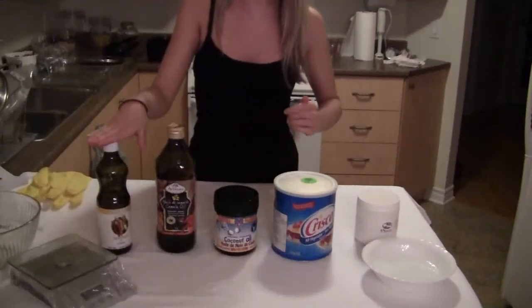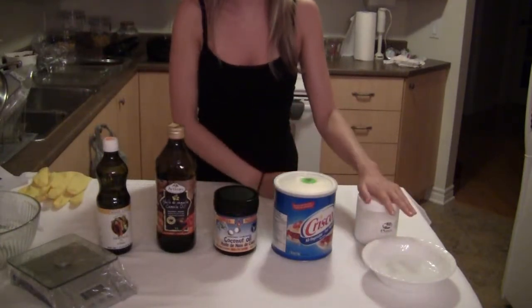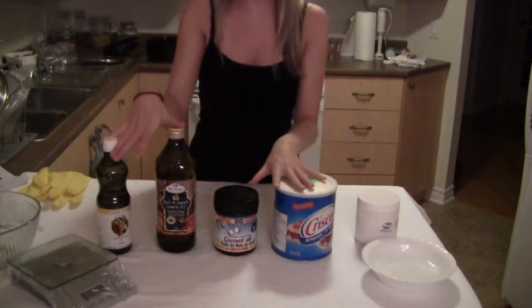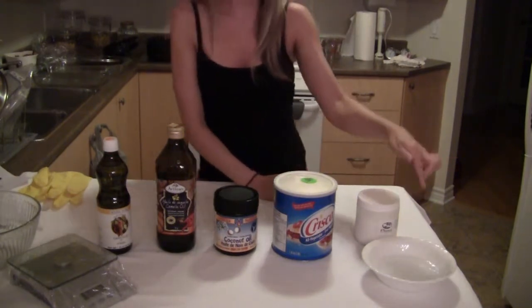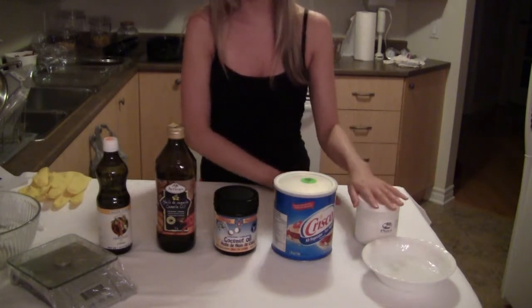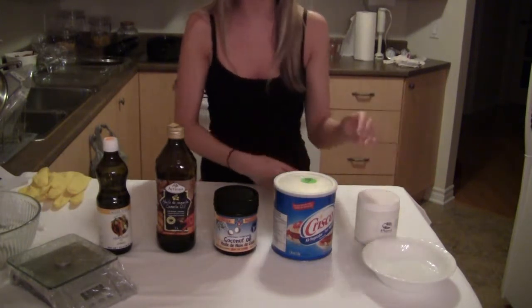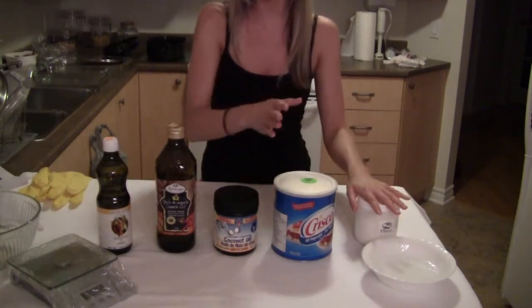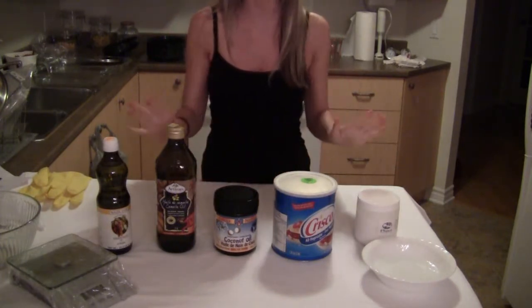Let's take a look at what we're going to be working with today. We have some grape seed oil, some canola oil, coconut oil, Crisco, and our sodium hydroxide along with some vinegar. These oils act as the fatty acids, sodium hydroxide is our base, and vinegar is an acid. We have the vinegar in case any of the base or lye spills, because we want to neutralize it. The fatty acids are going to combine with the base to make soap, and as a byproduct will give us glycerin, which feels great on your skin.